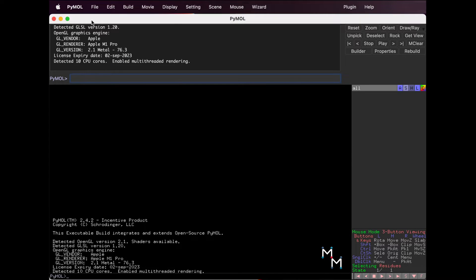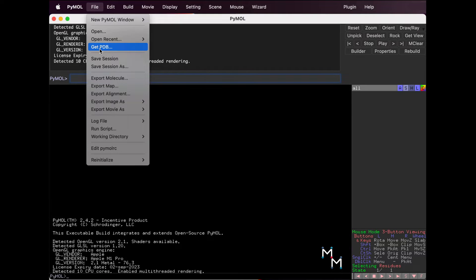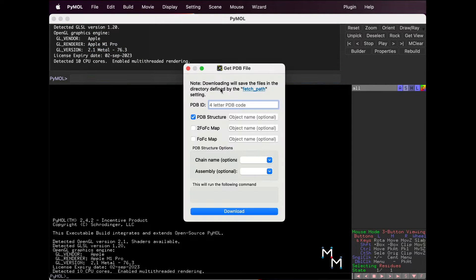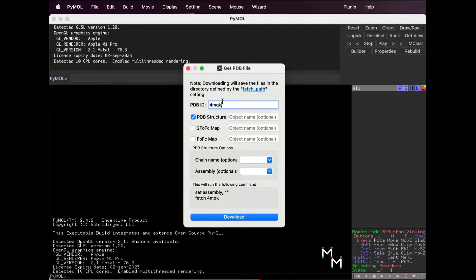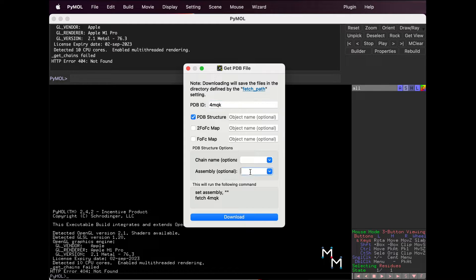To load the biological assembly of hemoglobin in Pymol, click the drop-down File menu and select Get PDB. Type 4MQK in the PDB ID box. Now, very important, type the number 1 into assembly.